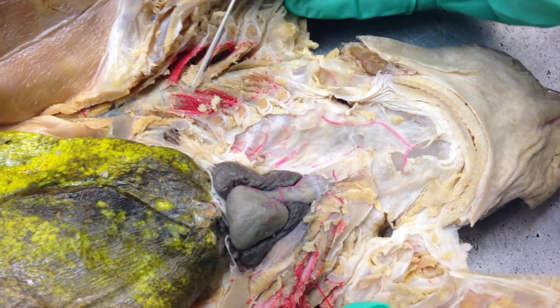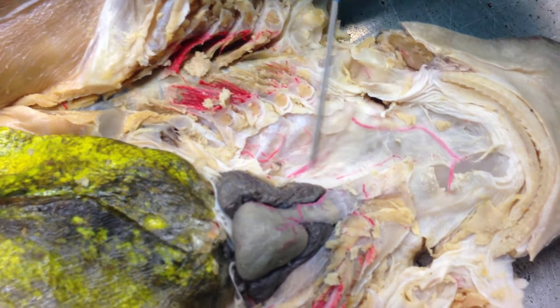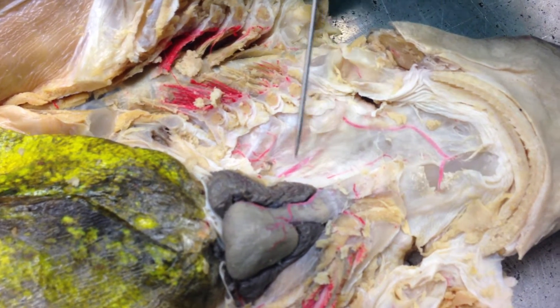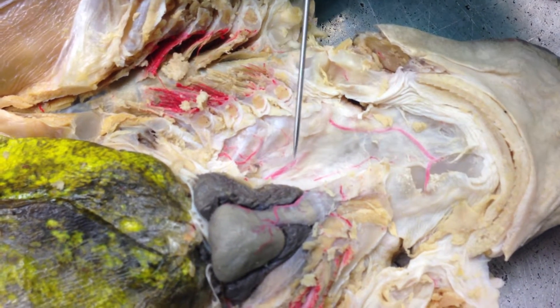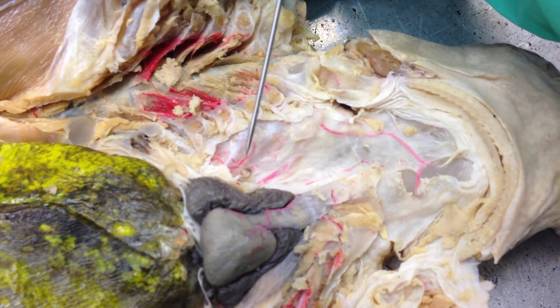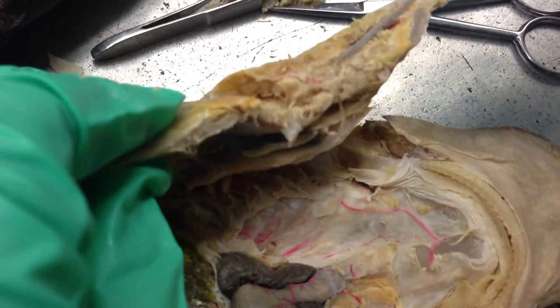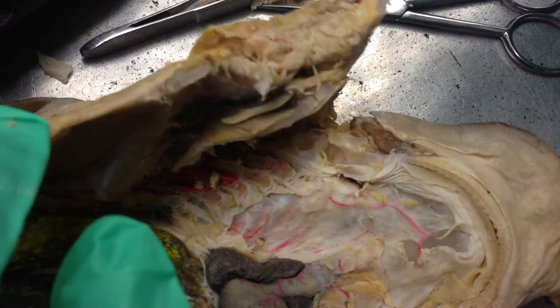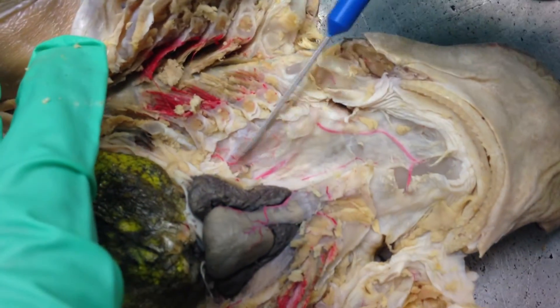This is our dogfish shark heart and aortic arches. You can see right here these arteries are your efferent branchial arteries. This is the dorsal side of the shark, so your afferent branchial arteries would be more on the ventral side, which would be in here. They're kind of hard to see because it's dissected, but those are the branchial arteries.